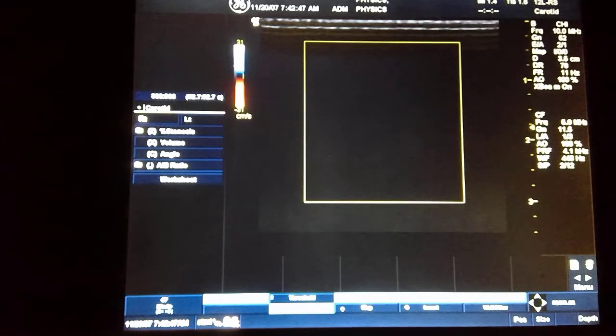Unfortunately, the video is not super duper, but that's okay. I think you will get the idea from what you are seeing. I'll do my best to describe what I'm changing and the numbers they read out on the screen, so you can follow along with everything that I'm doing.